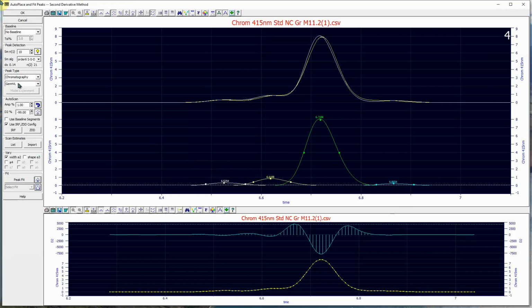The reason for that is that an IRF is a distortion that is evident in the tailing of a peak. In this particular case, we've got a problem because here's our principal peak and we have another peak sitting in that tail. The only peak that actually decays to 0 is the peak you see right here, and it's an exceptionally small one.